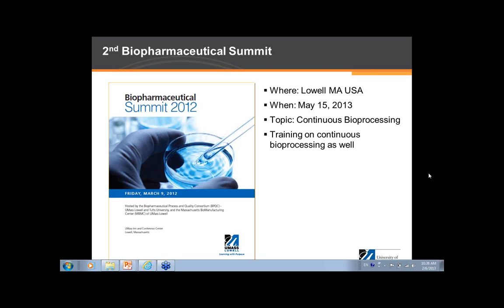By matching that to dielectric spectroscopy, we're hoping we can clearly indicate whether dielectric spectroscopy is able to measure the apoptotic process in the cell culture process. That's one of the ongoing projects we're conducting right now, and I will be able to share some observations in a few months.